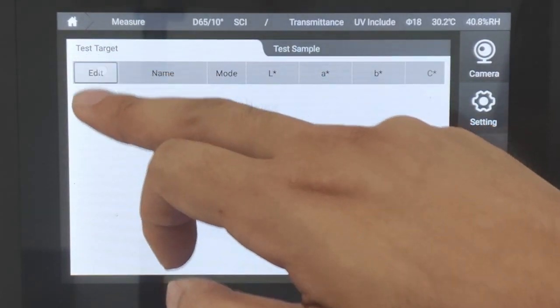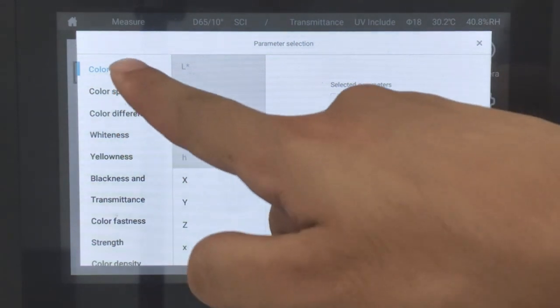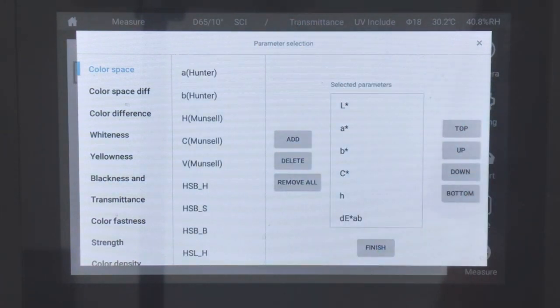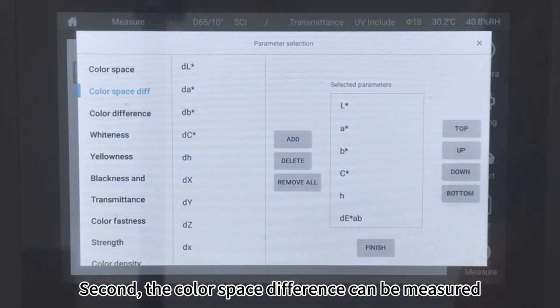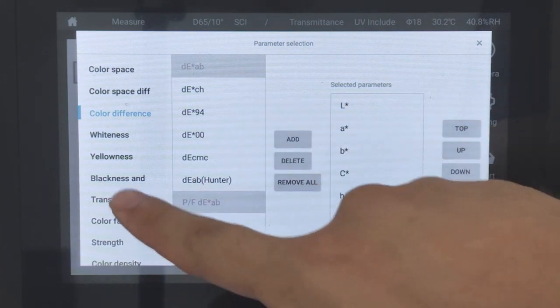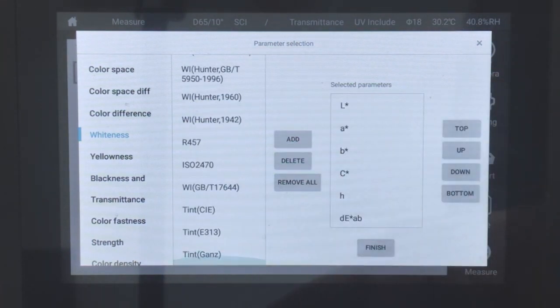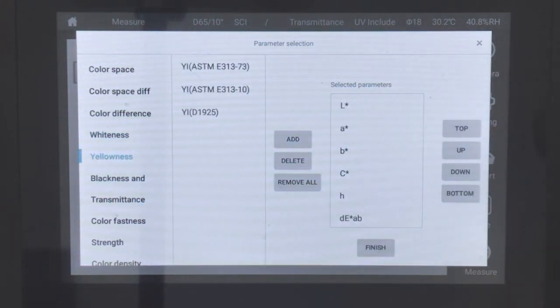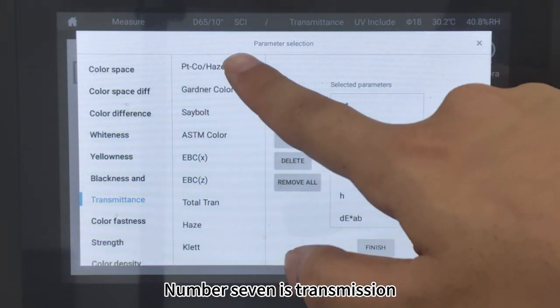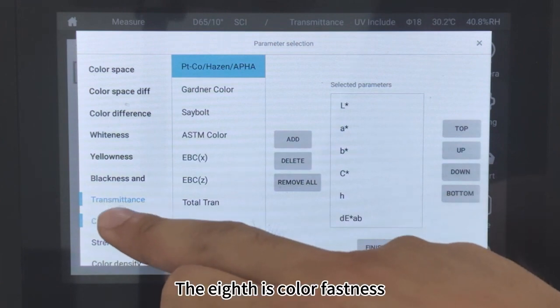Click Edit. The color space value can be measured; gray indicates selected parameters. The color space difference can also be measured. The third is the color difference type. The fourth is whiteness. The fifth is yellowness. The sixth is blackness and grayscale. Number seven is transmission, such as platinum cobalt, Gardner, Saybolt, and so on. The eighth is color fastness.